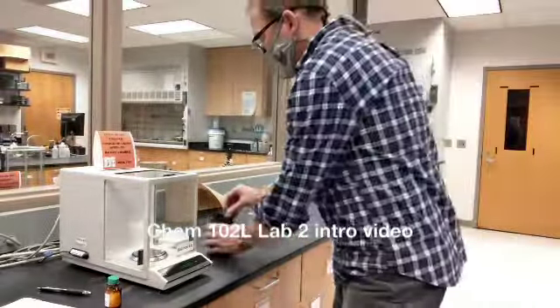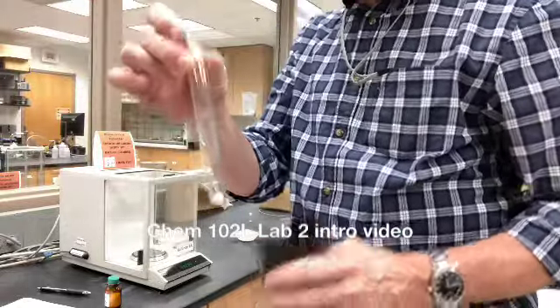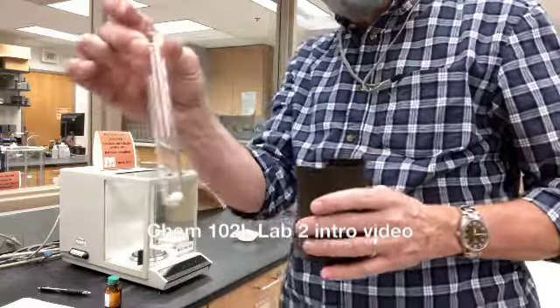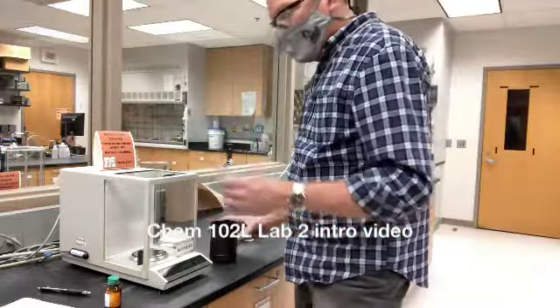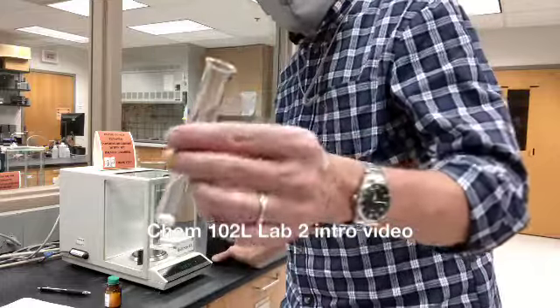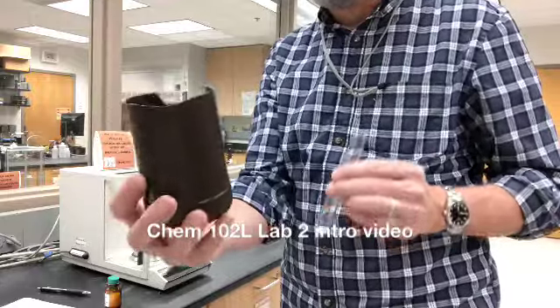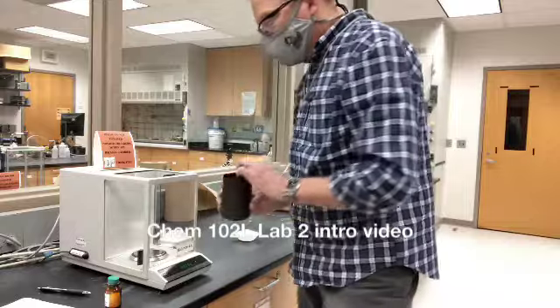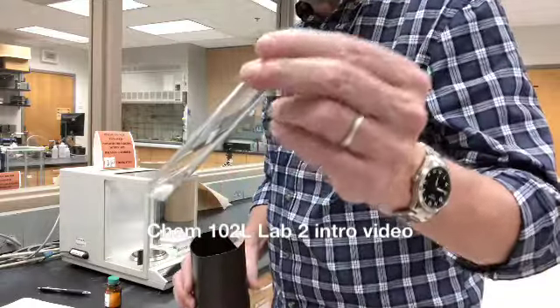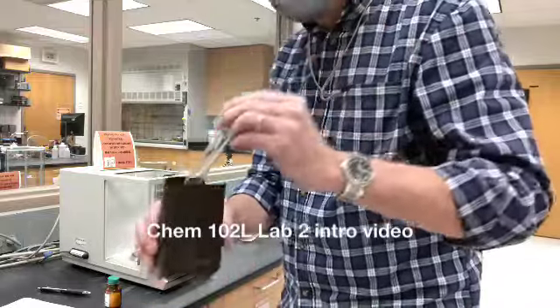And so here's our analytical balance. And here's the thing that I want to put it in. I want to put it in this test tube, and I want to know exactly how much I delivered to this test tube. On this analytical balance, to weigh something as awkward as this test tube, we have this plastic cutout device so that the test tube can just nestle in there. It also has a magnetic stir bar in there, which is what we're going to want to have in there once we've melted the sample.